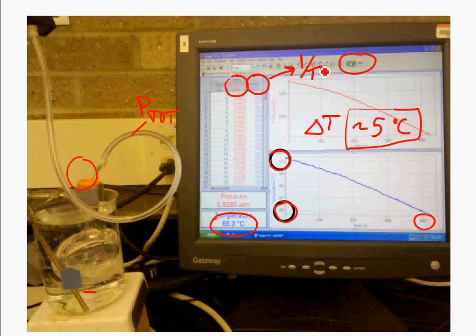The pressure, however, we have a little bit of a problem because this pressure measures the total pressure of all the gas in the system, which is equal to the pressure of the air plus the pressure coming from the water vapor. So we are going to have to figure out what is the contribution at each temperature coming from the pressure of the air that was in that flask, because it wasn't a vacuum in there, there was some air in there.